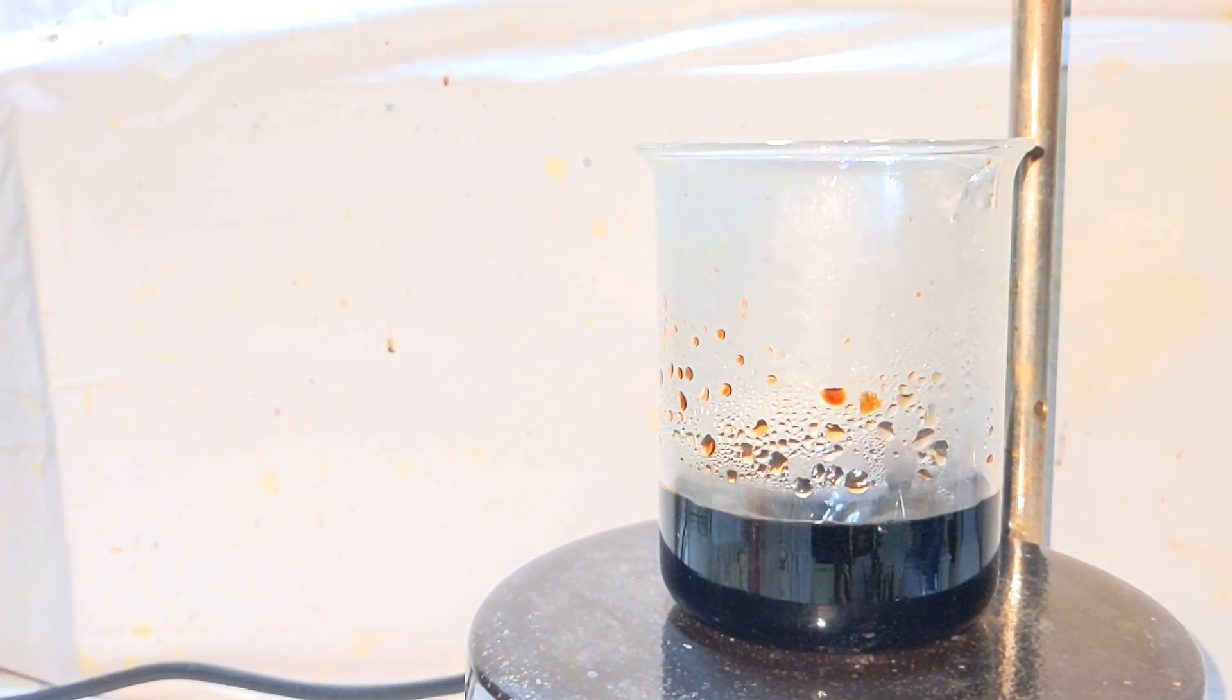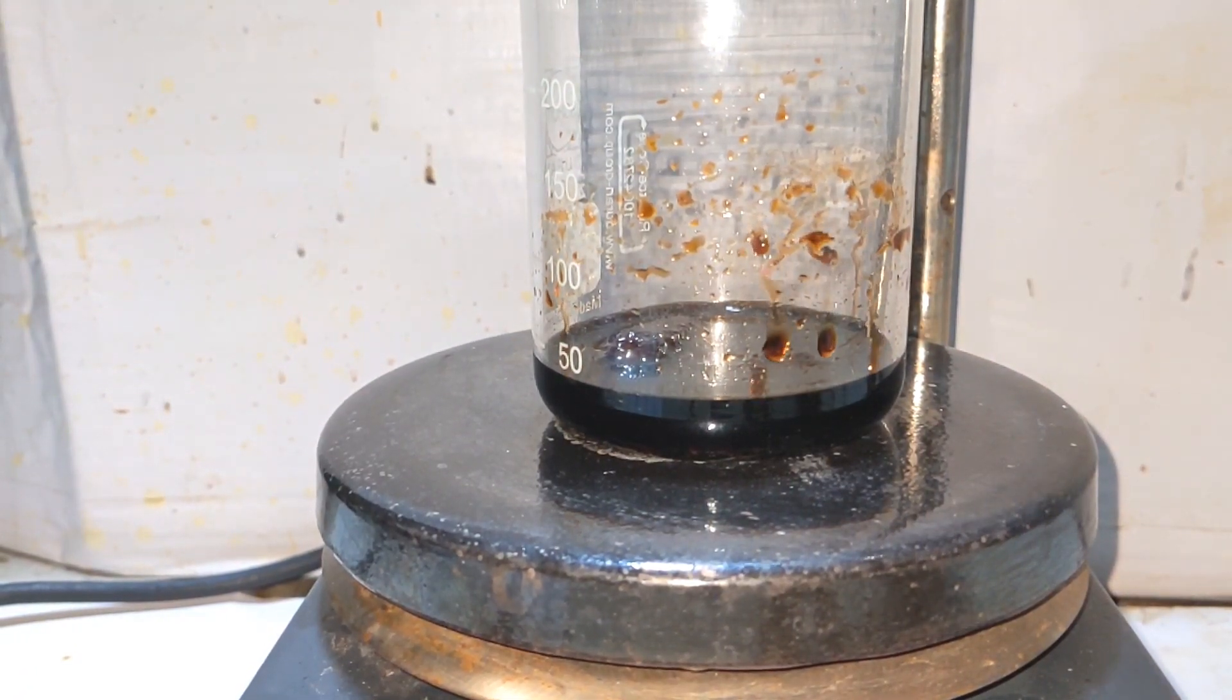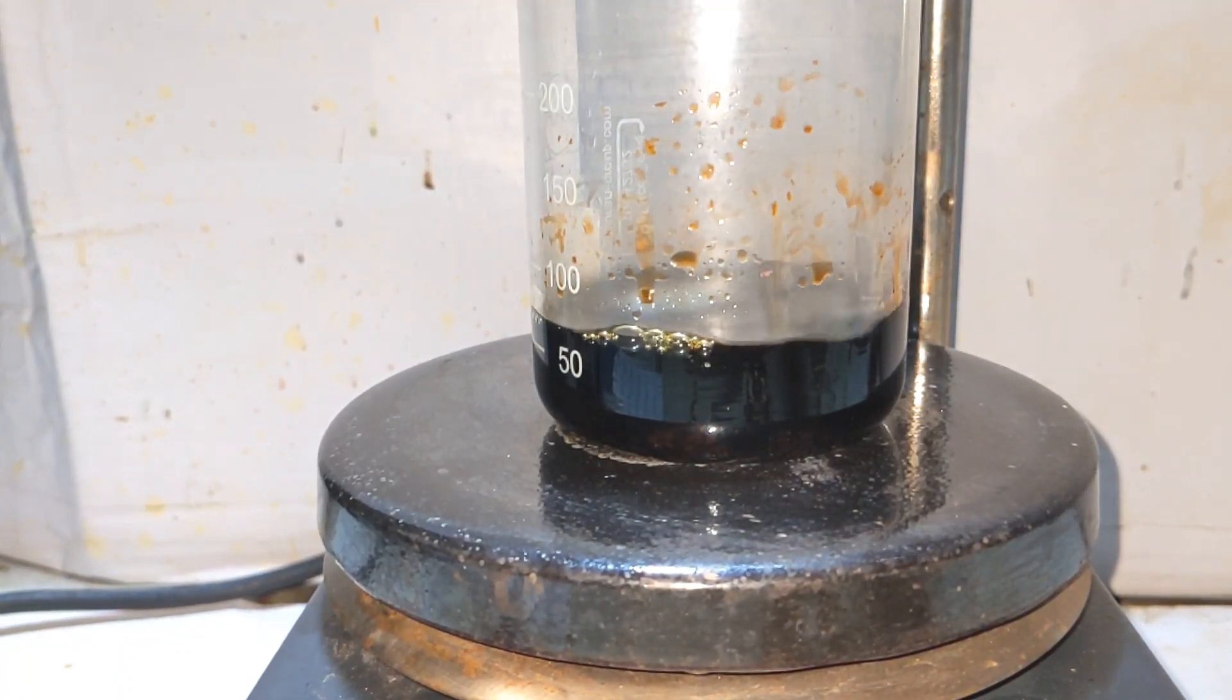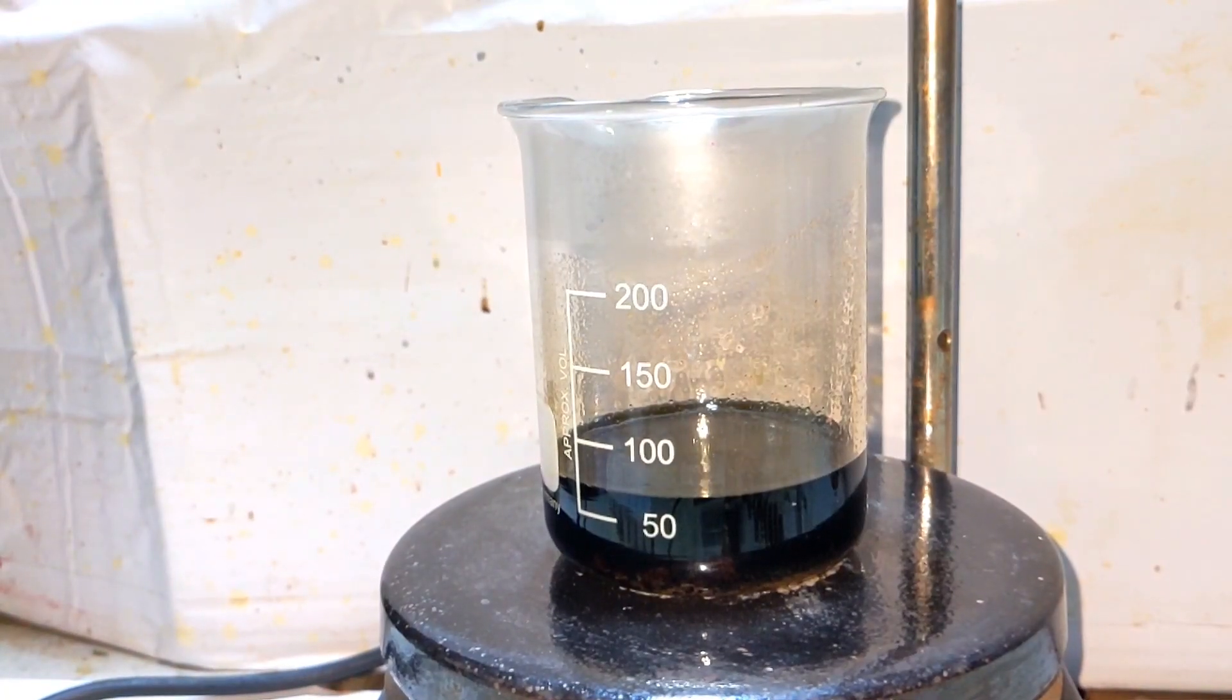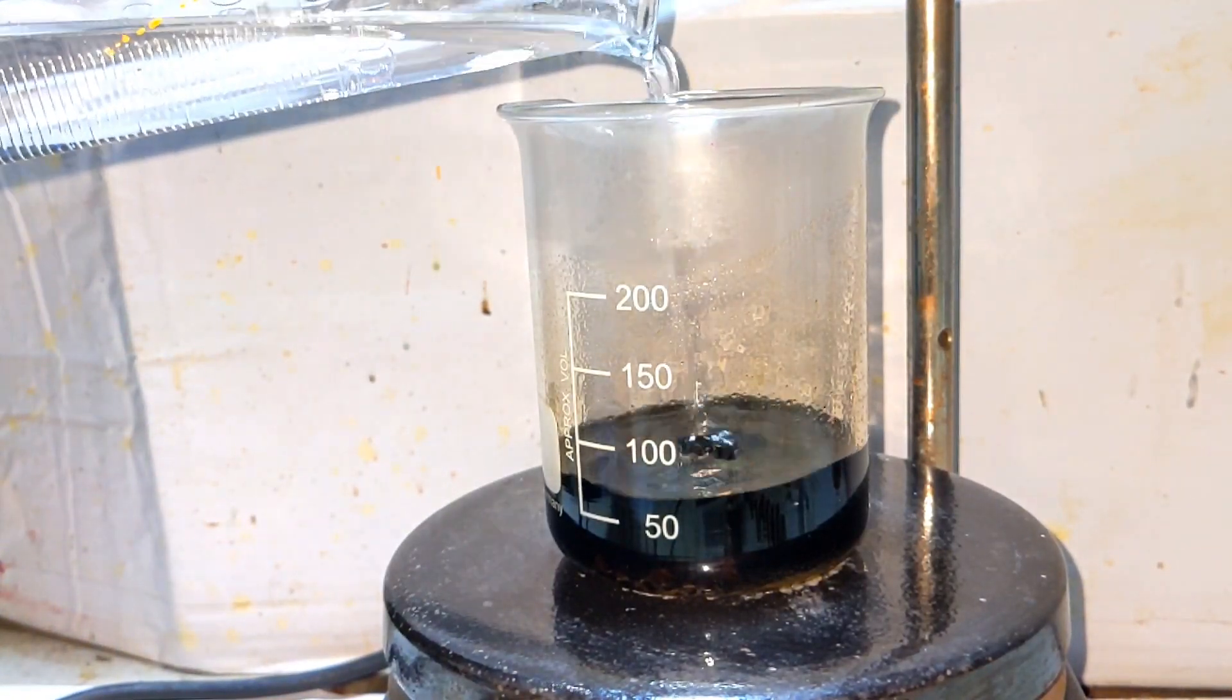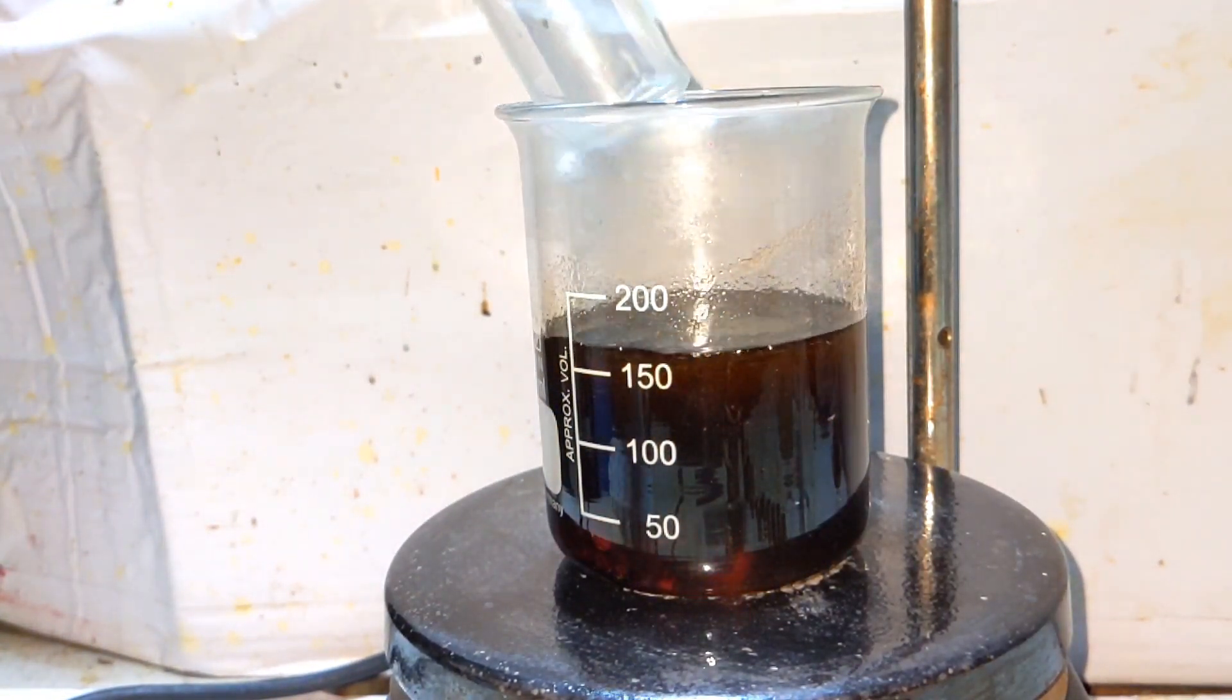After cooling down to room temperature, 50 milliliters, almost double the volume, of 37% hydrochloric acid was added. Then add 100 milliliters of 96% ethyl alcohol.